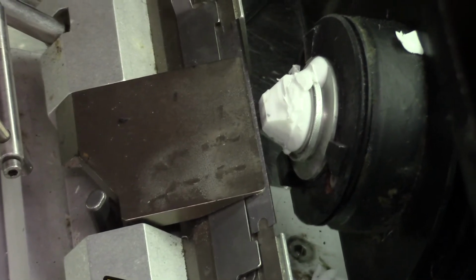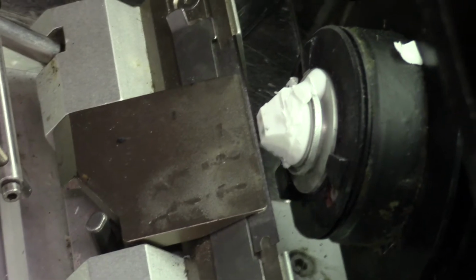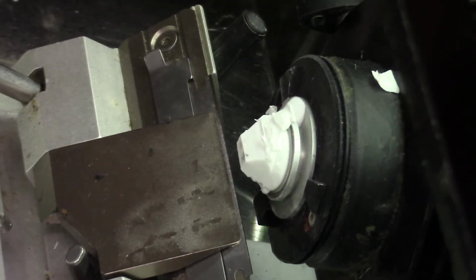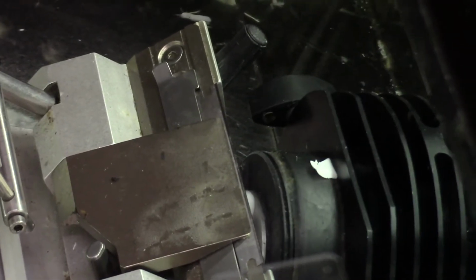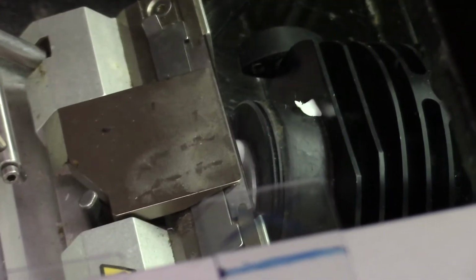So I'm now just gonna use the slower forward button. Okay, I'm almost touching. So now I have a lot less than a millimeter to go. So I can just crank and crank and crank. That little popping noise that you hear is a rubber at the back that keeps all these little shards from getting into the workings of the machine. So it's just flapping back and forth.